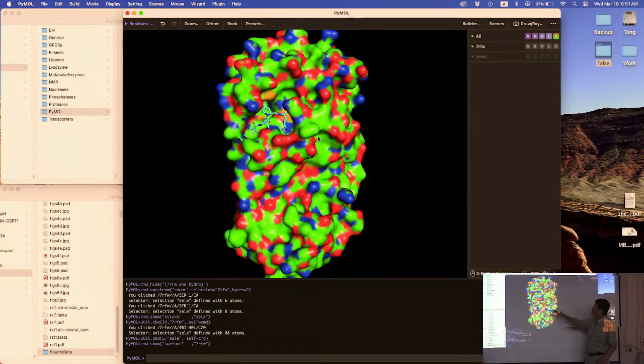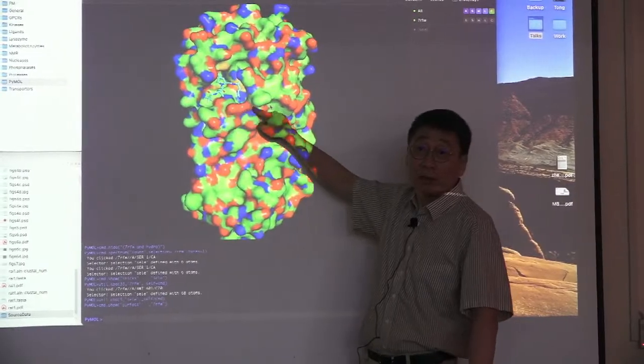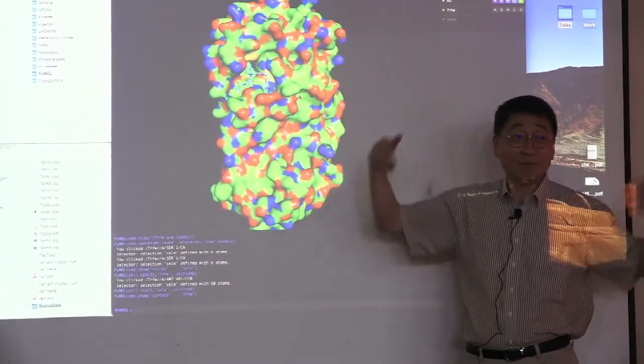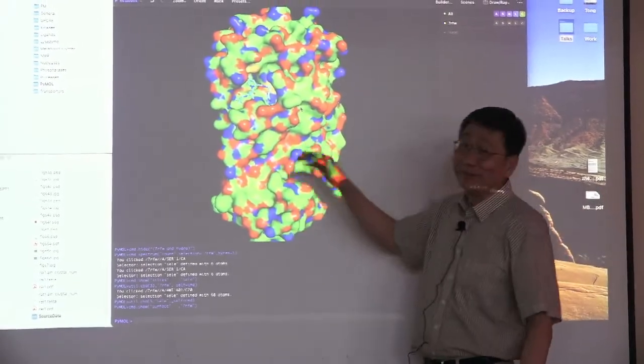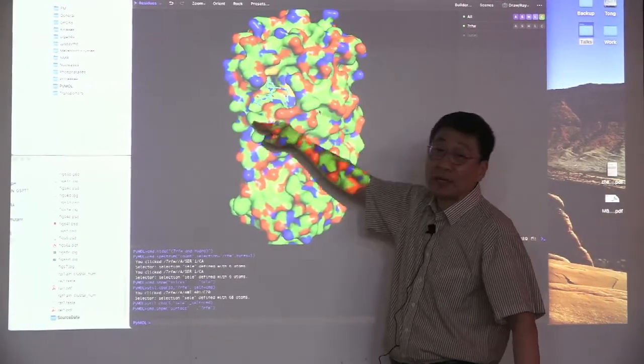when you get it, you can sort of see the nice pocket here, right? You see a pocket? Yes, you can see the pocket. Anyway, please practice. You see a pocket where the compound is bound.